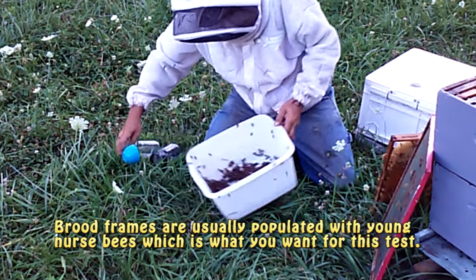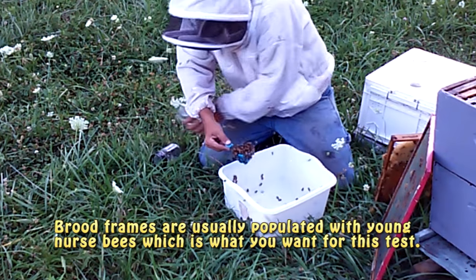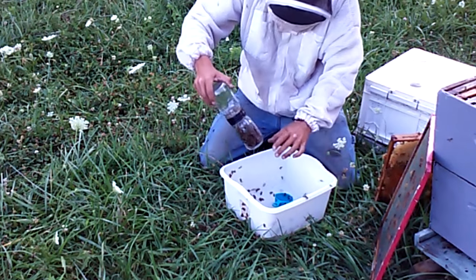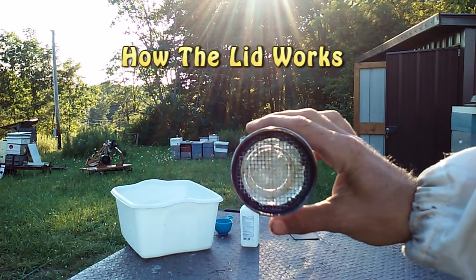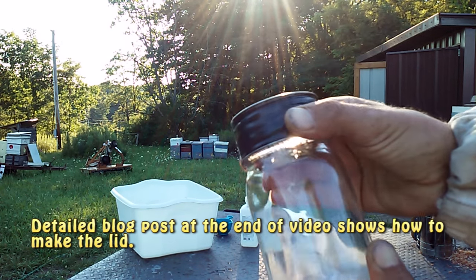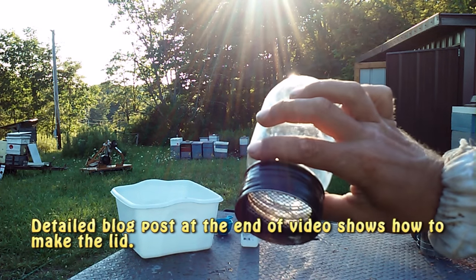We're going to bring them all to one corner, getting a nice scoop. Now on goes the lid. It's approximately 300 bees. You can see here on the lid it's got a hardware cloth, and it's actually two lids that I've soldered together, so that I'm able to screw a jar on the top and a jar on the bottom. That works really well. Is it needed? No — you could just put the hardware cloth over your lid and simply pour it into a white bowl or something and do your mite count.